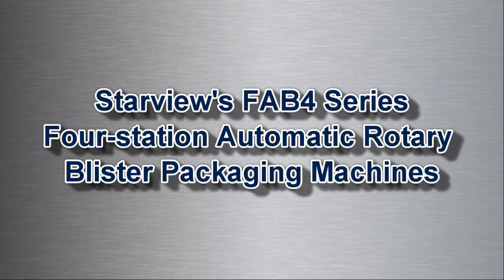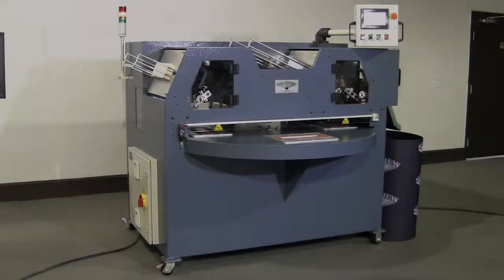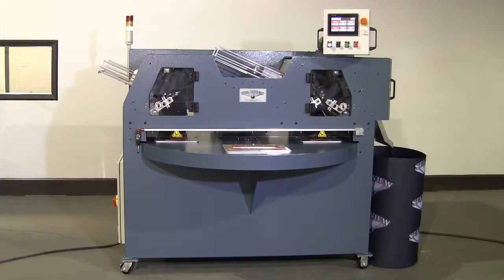Starview's FAB4 series fully automated rotary blister sealing machines are ideal for high volume or just-in-time production. Under proper conditions, these machines are capable of producing at a rate of up to 22 cycles per minute.